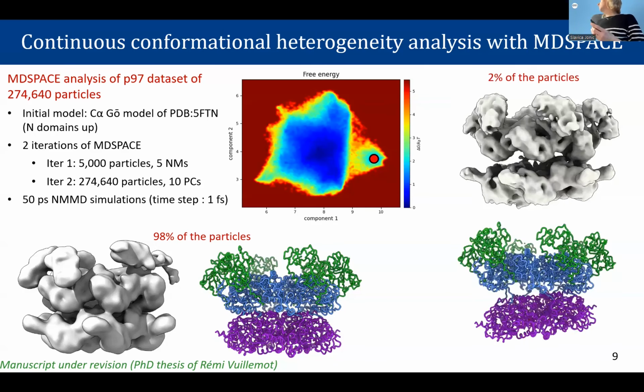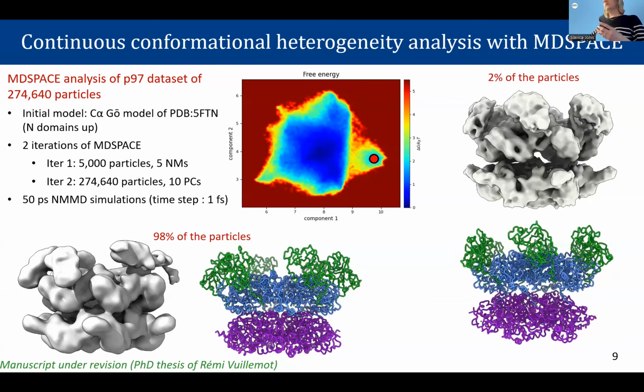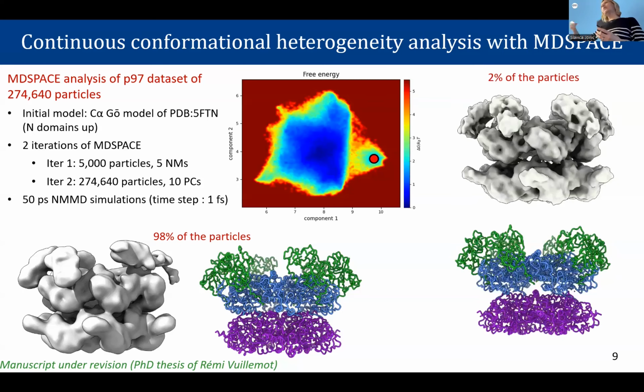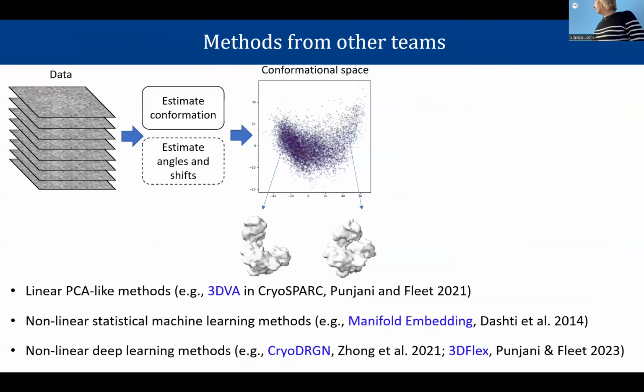And then when you display this in Chimera, it will draw these kind of structures with wire, because otherwise, if we had all atoms, then you would see much nicer features.